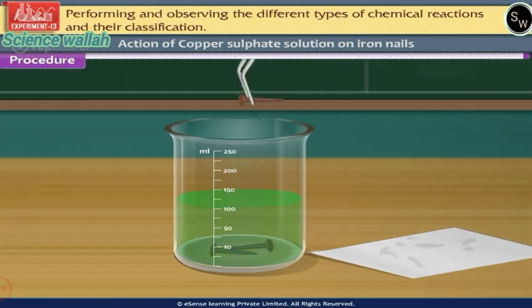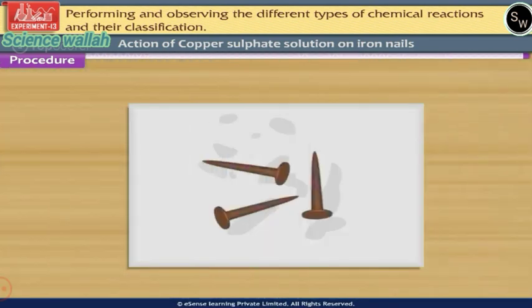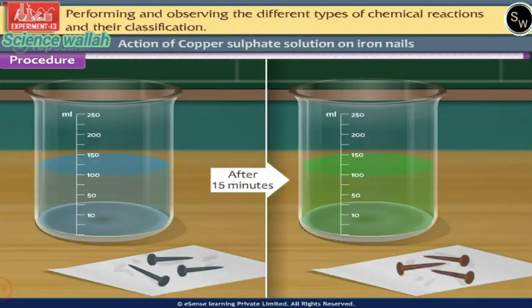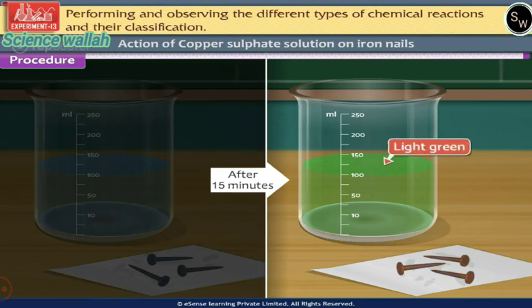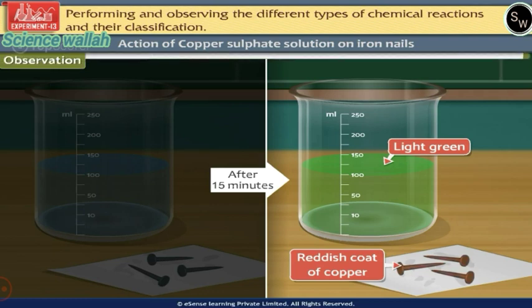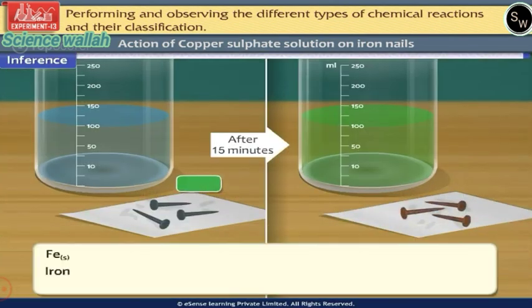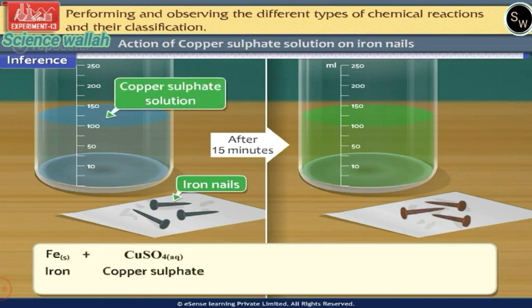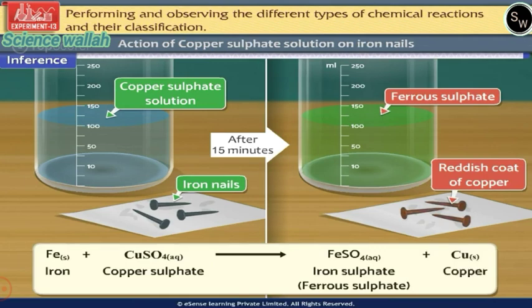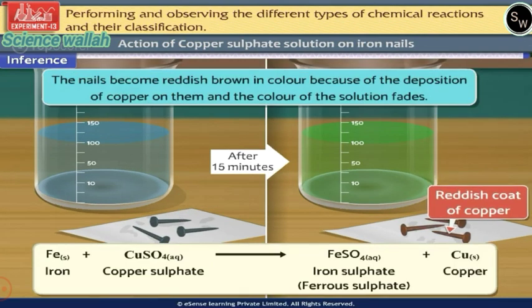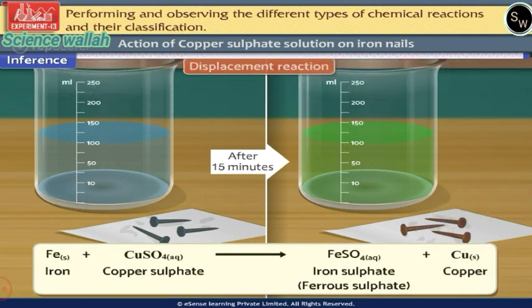Remove the nails from the solution, wash them with water, and place them on a filter paper to dry. The colour of the solution has faded, and the nails have become reddish brown in colour. Inference: iron displaces copper from the copper sulphate solution. The nails become reddish brown due to deposition of copper on them, and the solution fades. This is an example of a displacement reaction.